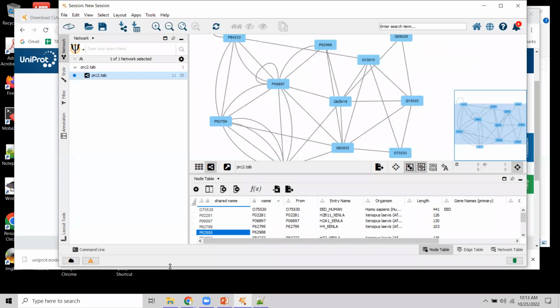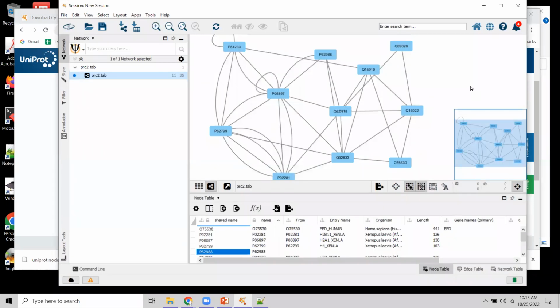And this is probably one more thing. Once you get your initial data in, and every time there is a major step in data processing, like getting new annotation in, then it's wise to first start saving things.